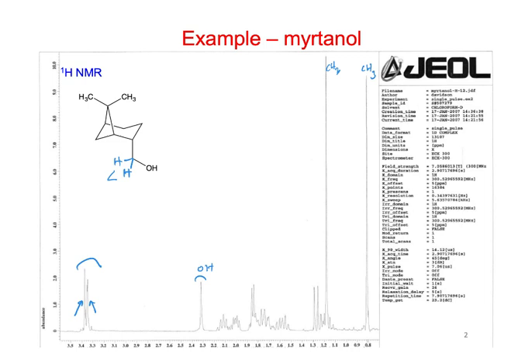And so I guess that was my thought process on why. Right, of course. Yes, that seems reasonable. I was just double checking. They are in the proton NMR, right? They're quite different from one another, but they are the most upfield signals.